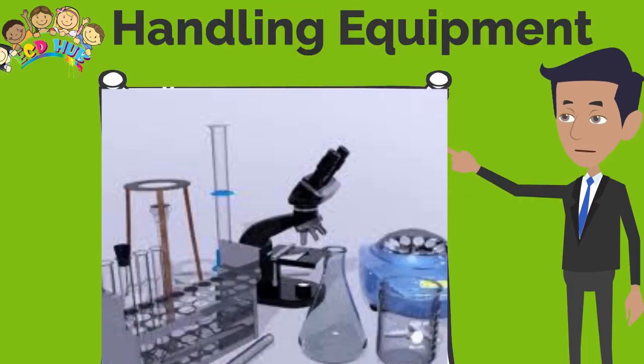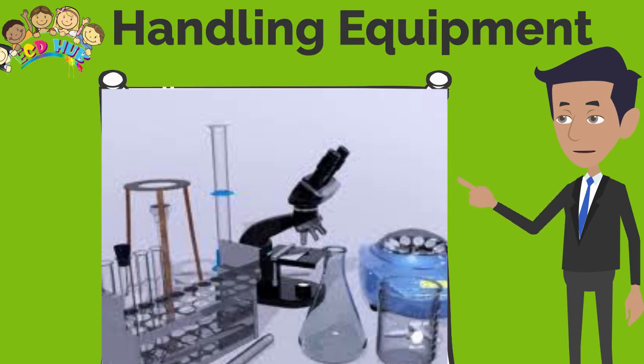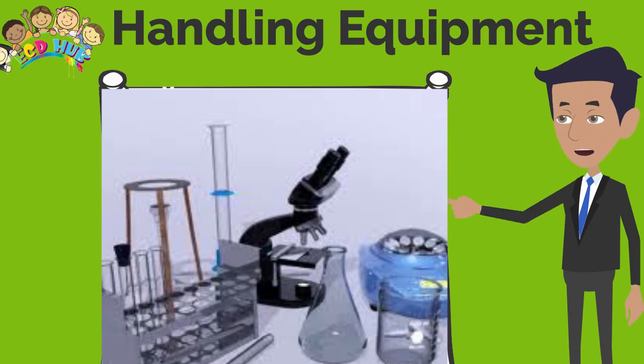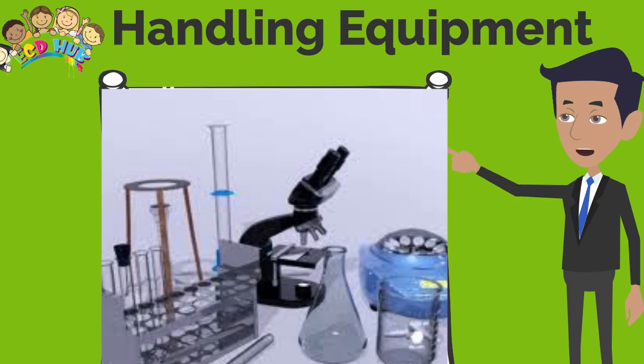It is important that when you are using different lab equipment, you handle them with care. Microscopes should be held with both hands, one underneath and one on the arm. When handling glassware, be sure to hold it with both hands when you can.